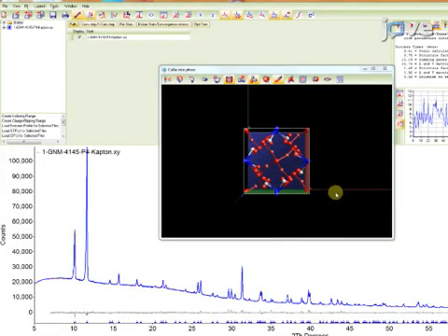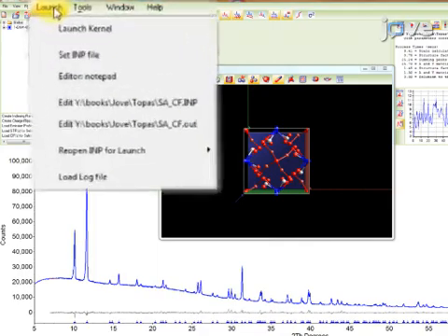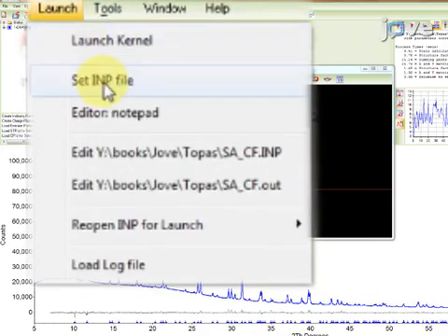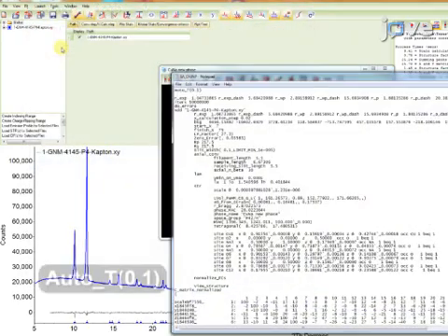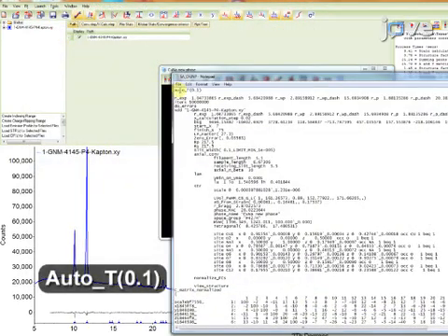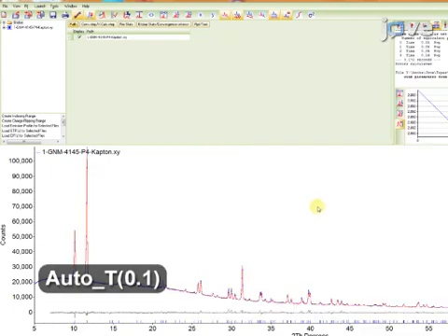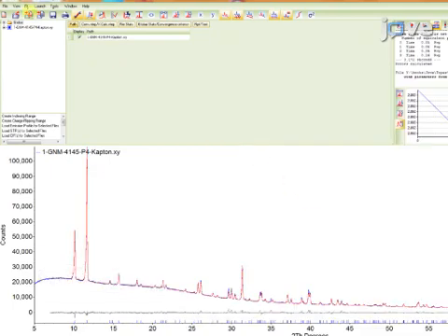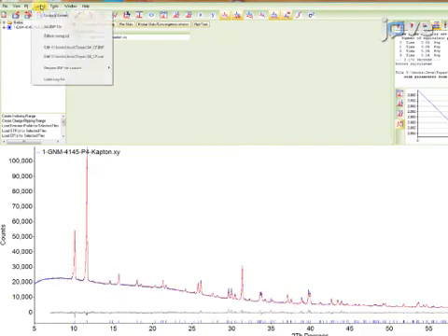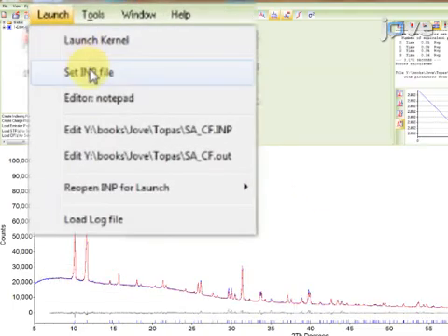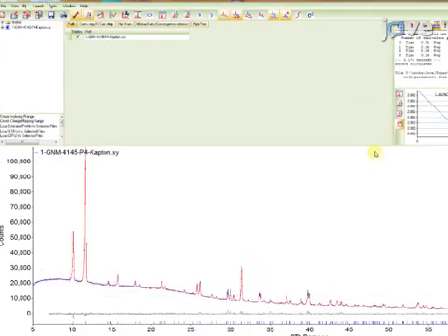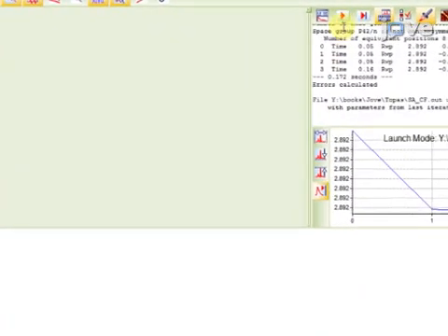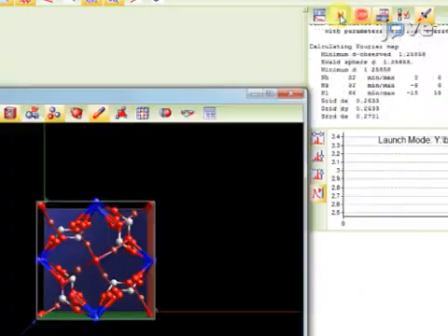The final step is to turn off simulated annealing and switch to the Rietveld refinement mode by commenting out the appropriate command. Under Launch, choose Set INP File, and select the prepared input text file. Finally, press the Run button and click Yes.